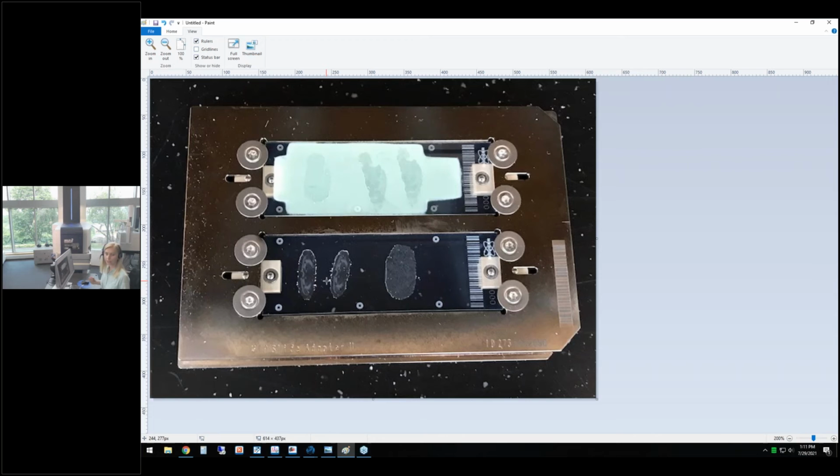In this way, we can identify the position of the sample on the target surface. On the top, you see another IntelliSlide with tissue samples, which was covered with a uniform layer of matrix. And this glass slide is ready for data acquisition.